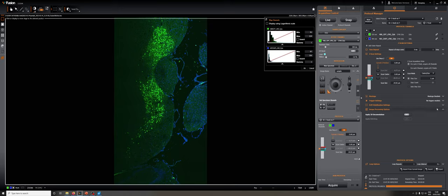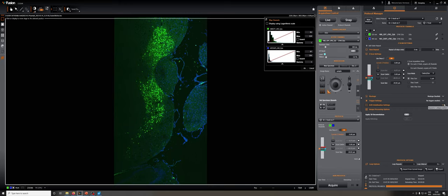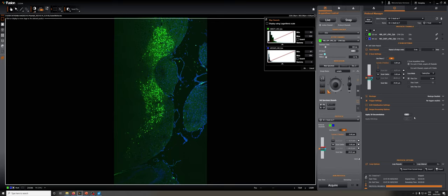We aren't going to use any montage settings, trigger settings, or drift stabilization settings. One thing we can do, which I'll discuss in a separate video, is apply three-dimensional deconvolution to this data set automatically at the end of the acquisition. I'm not going to do that right now. There will be an optional training video about that, but that is formally an option that we can take.